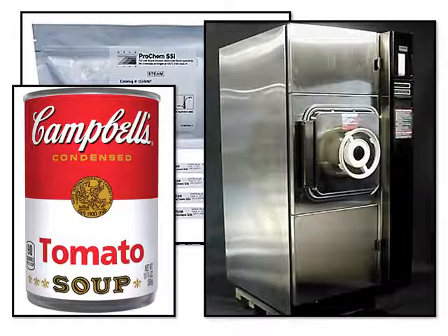All right, so you use the spore strips to test your autoclave. And then you can also use the spore strips to test the effectiveness of your food preparation technique. So there's a company that makes soup. Typically, a company like Campbell's Soup would have dozens of those pressure cookers that they're cooking the soup in. They would take one of them and they would put a batch of soup in there, and they would put a spore strip in there with it.